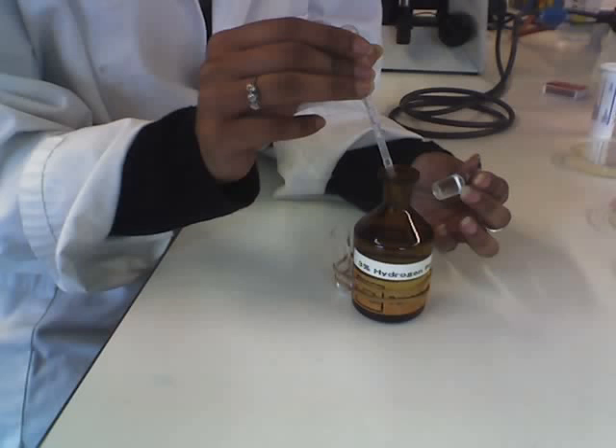Now put the culture on both of the marks. Then add hydrogen peroxide on both of the marks.